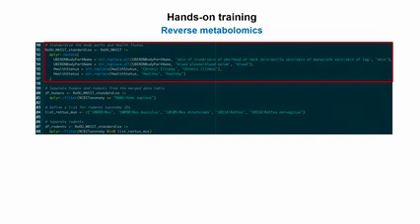Because otherwise it will aggregate everything to skin. Same for blood. If you have plasma and serum, we combine them to blood. But if you're interested in a specific molecule in the plasma or the serum, you again want to comment that line. And then we just do some formatting here. And then we separate two types of organism.